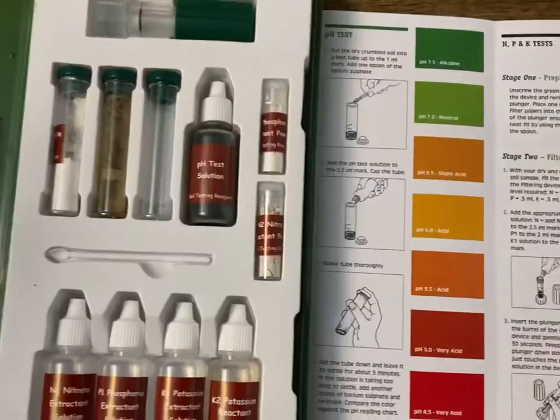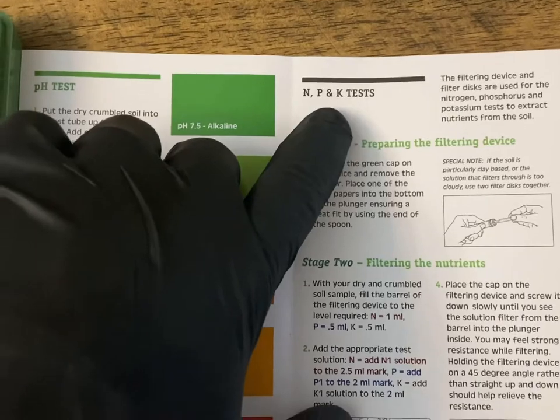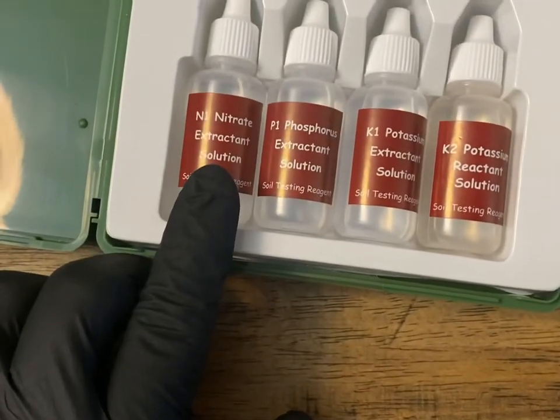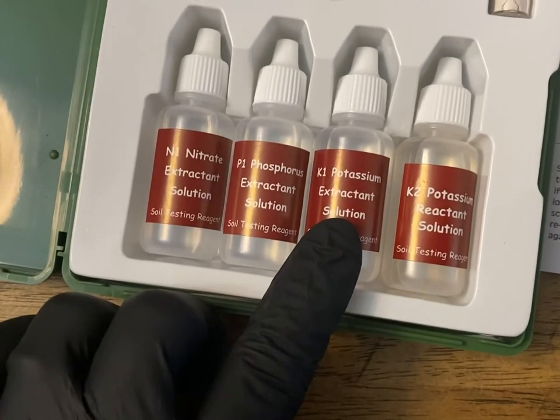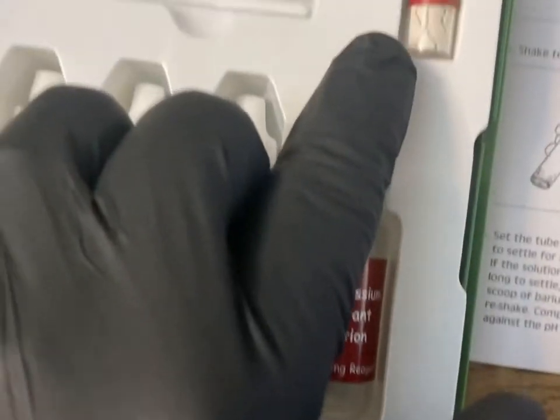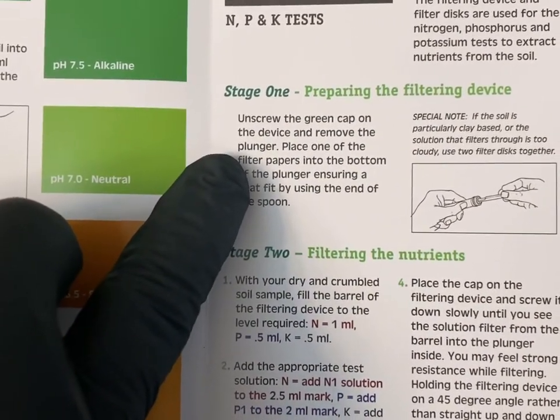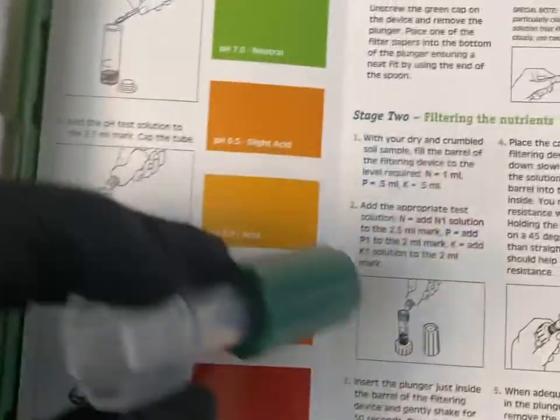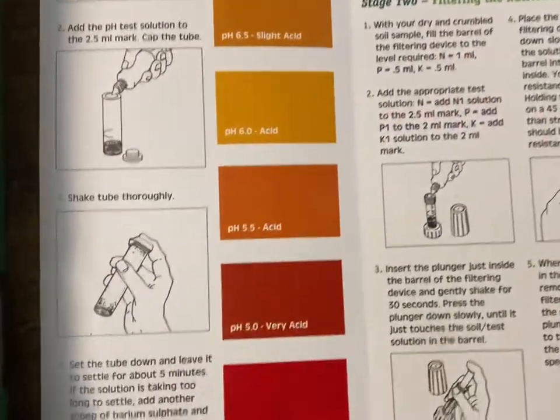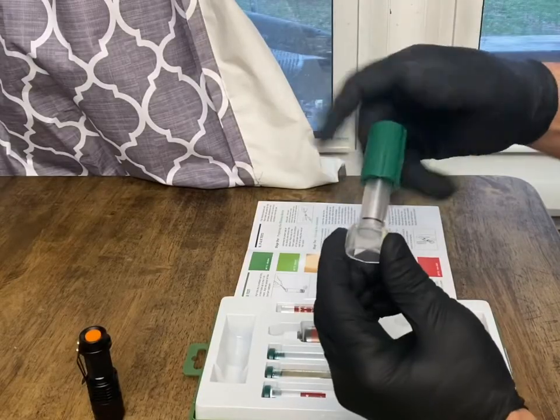There are some other things you can do with this kit like test nitrogen, phosphate, and potassium. We've got a nitrogen, phosphate, and potassium extractant solution, and then we have a liquid reactant for the potassium, a powdery reactant for the nitrogen and phosphate. Step one: unscrew the green cap on the device and remove the plunger — that would be this device here. I'm going to hang the phone up so you can see me do this with two hands.